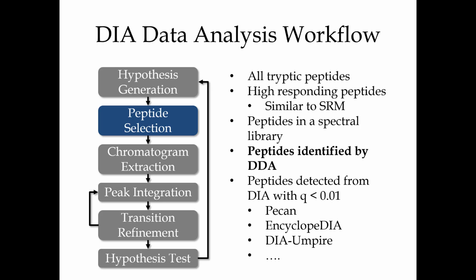If we select the right chromatograms, they can have no interference at all and be beautiful, and then we get nice quantification out of it. So that's the idea of why you might want to do a DDA experiment that's just a bunch of replicates to know what you can measure, and then go to DIA data where you're going to get fragment ion chromatograms and quantify out of that.